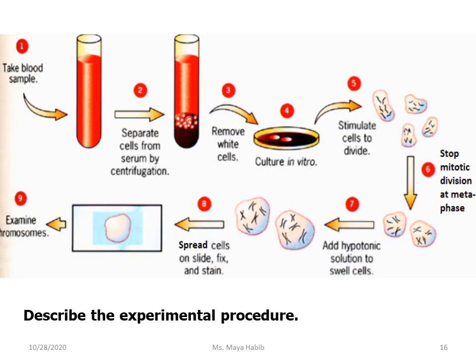You know that blood contains different components, but since we are interested in studying chromosomes, that's why we need to work with cells, specifically nucleated cells, because, as you have seen earlier, the chromosomes are found within the nucleus. Blood cells include red blood cells and white blood cells. The red blood cells do not have a nucleus, so we say these cells are enucleated and they are not needed in this case, but the white blood cells are nucleated, having a nucleus, so we are interested in these cells in our work.